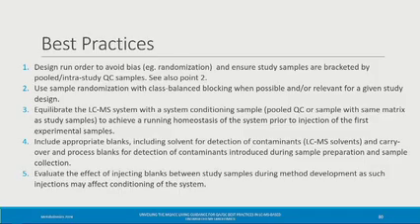I'm right now trying to remember where I've seen data. It wasn't data from an LCMS context, but I have seen data for sure where blocking is incredibly important. Especially if your instrument does drift and you don't pick up on it, then you will see, if you run all of your sample type A at the beginning, all your sample type B in the middle, all your sample type C at the end, and your instrument drifts over that time, and you have no way to detect and or correct for it, then you're going to have a problem, right?